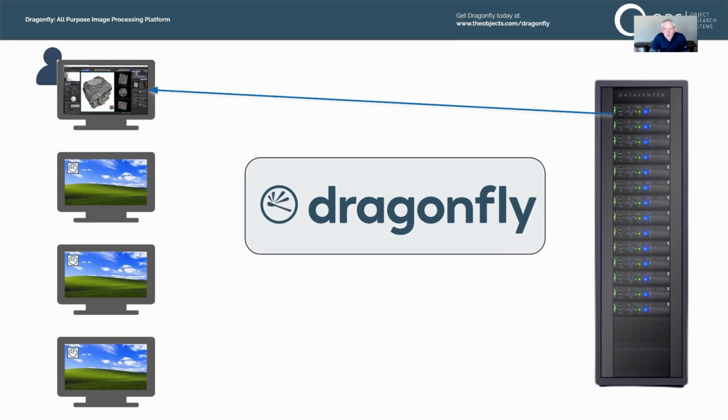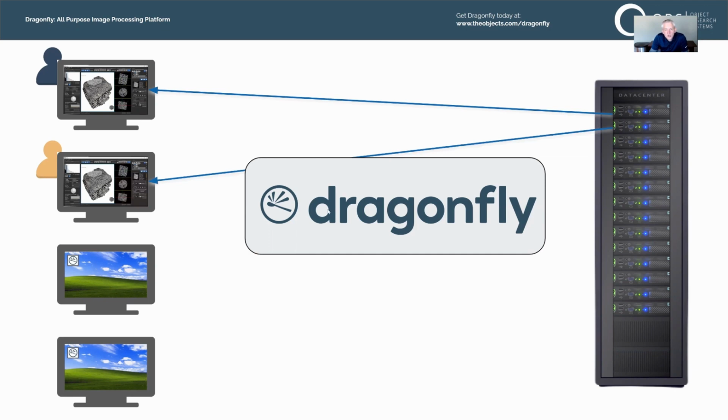So this is the establishment, the connection. You don't have to think about remote desktops. You don't have to think about, do I need to check on the availability of computer 1 or computer 2 or computer 27? The Dragonfly VizServer takes care of that for you. Now, Alice is happily working. Bob comes down and sits at his desk, and he's ready to start his day, and he goes through the same process. The VizServer finds a computer and establishes a connection. And Charlie's a late riser. Charlie comes in and repeats the process. So you distribute your central resources available throughout the organization. So whether you're sitting at your desk, or whether you're sitting in a conference room or sitting in the lab, you can get work done.